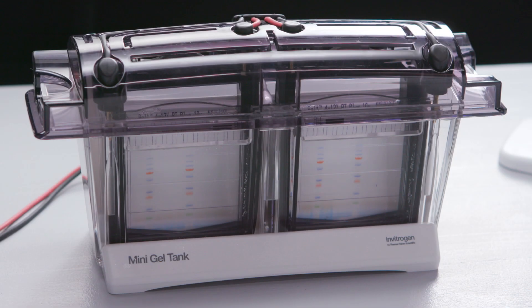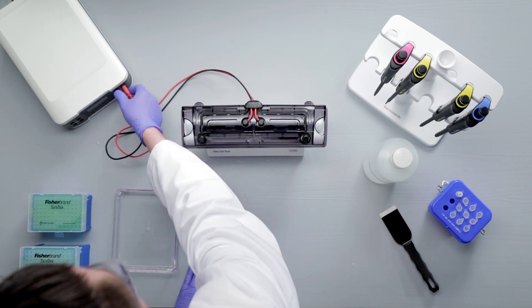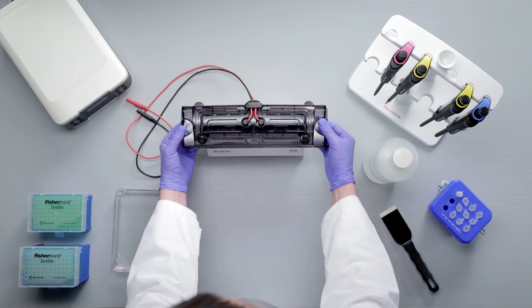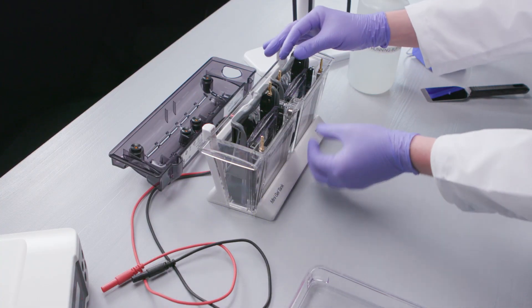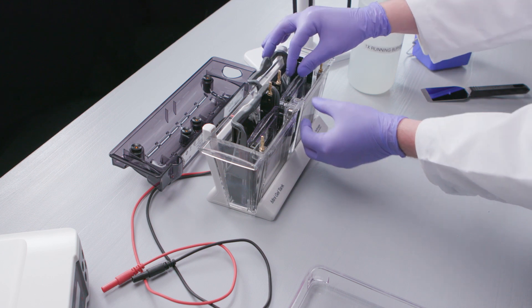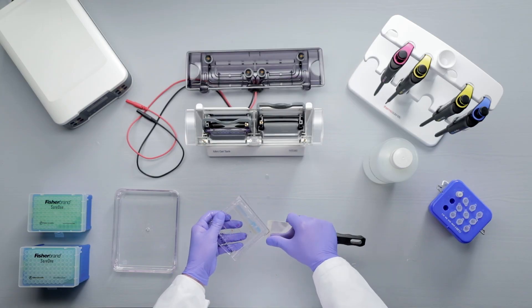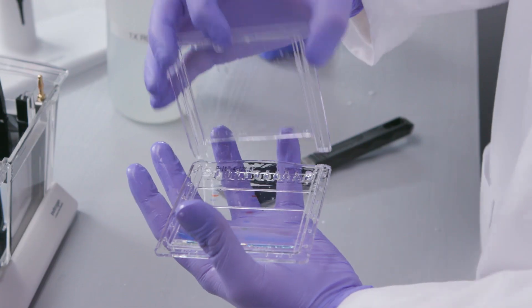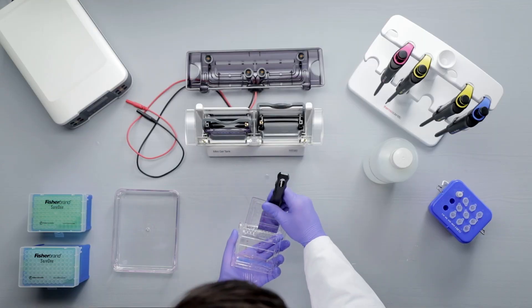At the end of the run, as determined by time or when the dye front reaches the foot of the gel, turn off the power supply, disconnect the cords, and remove the lid by placing your thumb on the tank handles and pulling the lid up with your fingers. Remove the gel cassette from the electrophoresis tank by releasing the cam handle. Carefully separate the gel from the plates using the gel knife. Remove the foot of the gel and wells.